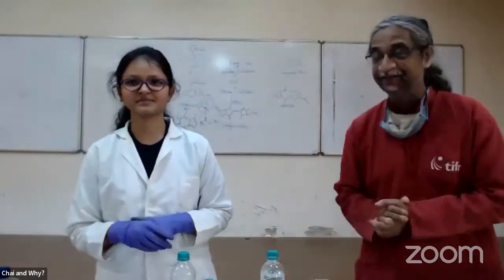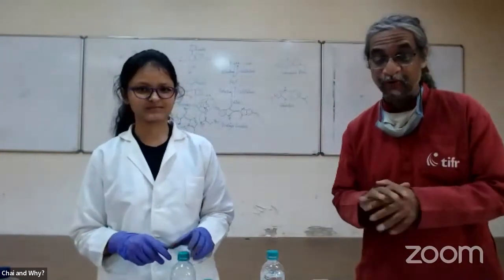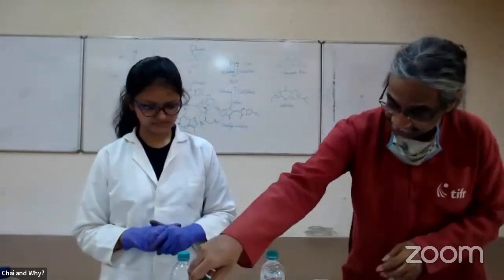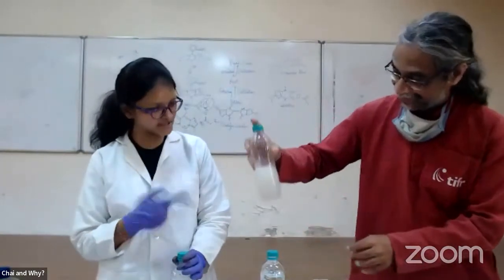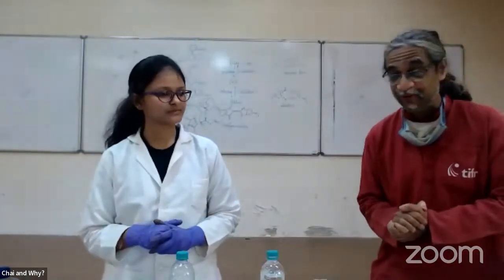People here just remain here. For the online audience, thank you so much for watching us. We hope you enjoyed some of these reactions. And what's this? This is also the same, right? No, this was that. Oh, this was the other one. It did change color as well. Yes. Very diluted. Okay.